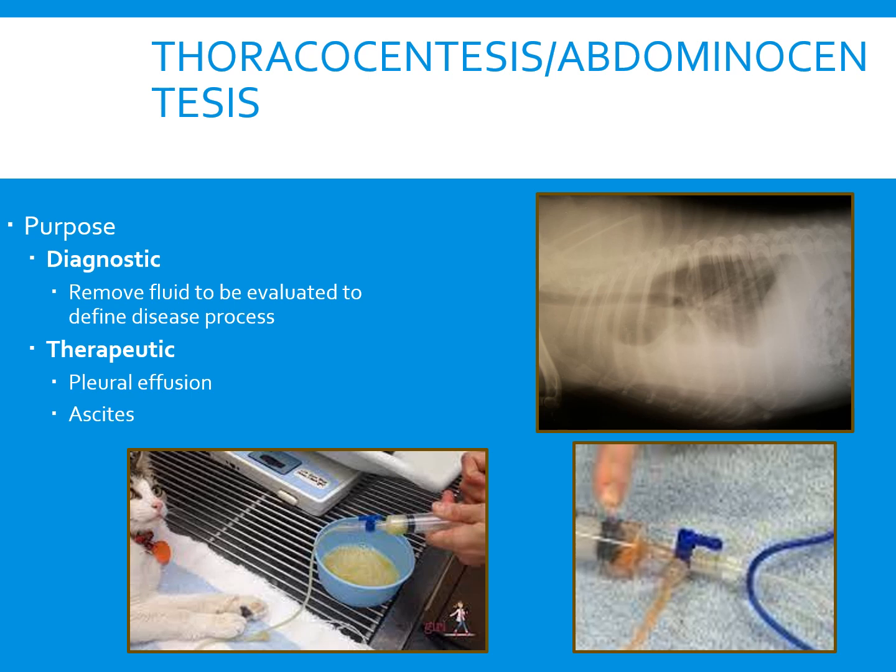When there is a large amount of fluid, something that is helpful is a three-way stopcock. And that is what is here on the bottom right.